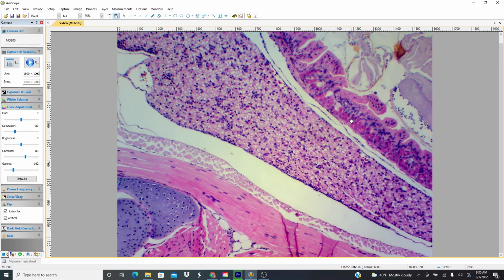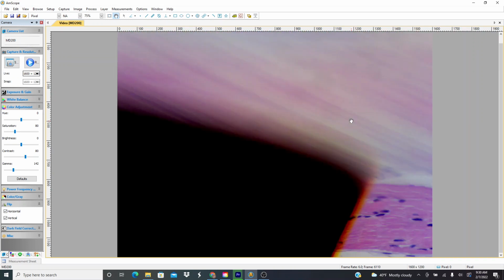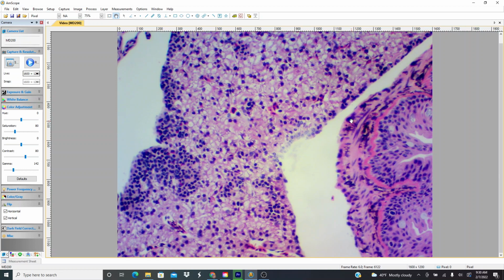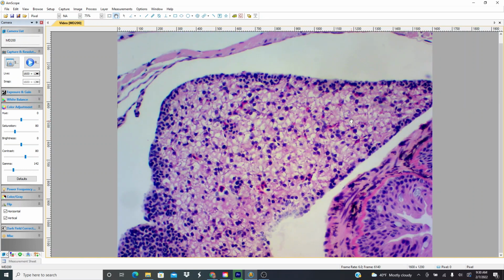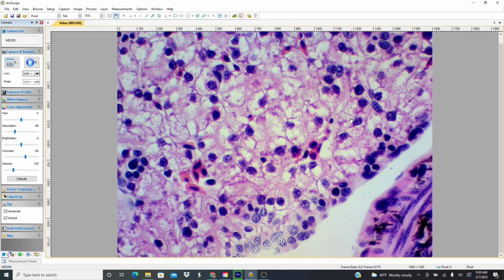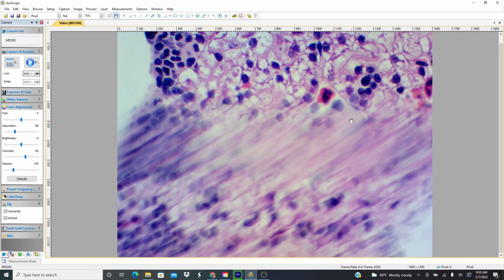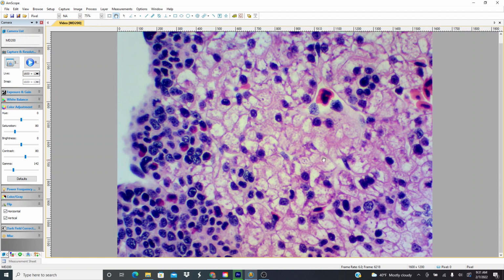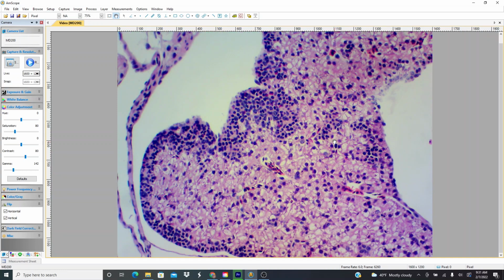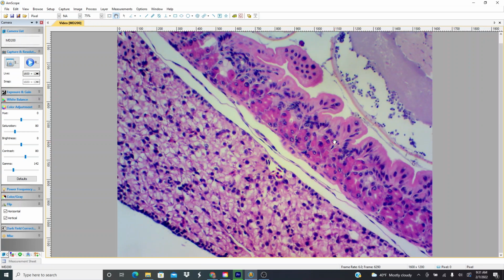Now this thing, this structure here, I don't know what this thing is. These cells, let's see. You've got red blood cells coursing through here. These other cells, all this stuff, I'm not sure what this is. Here's some red blood cells here. This structure, I'm not sure what this is. It doesn't look like it has a human counterpart.